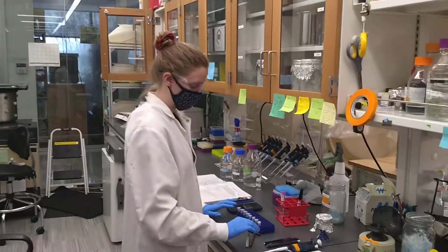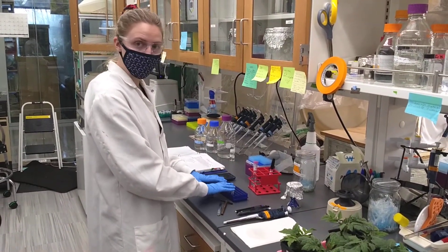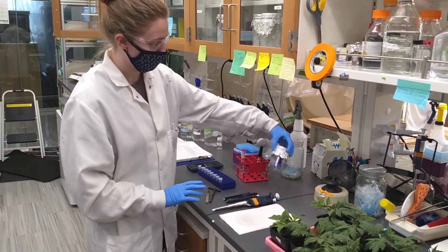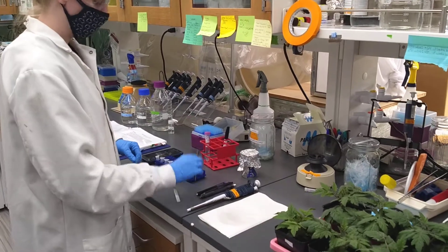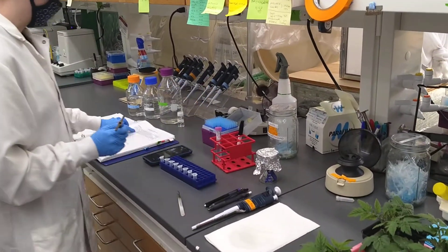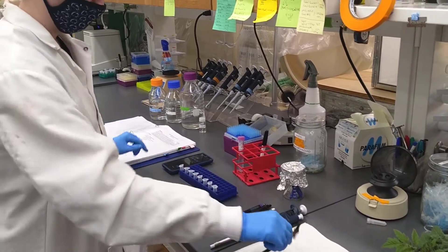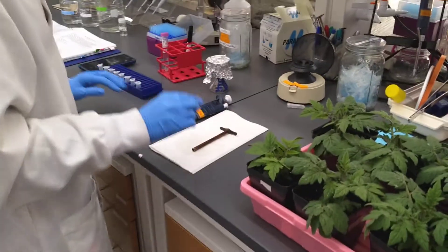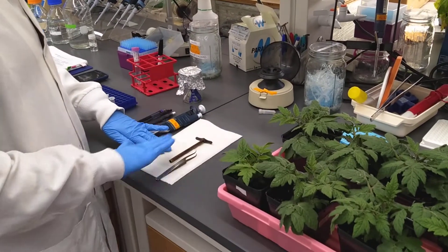The procedure is quite simple. We're going to use 1.5 ml microcentrifuge tubes and sterile micropestles. We're going to use a number 3 hole punch — the procedure specifies exactly the size hole punch that you need — and we're also going to use tweezers. We'll be sterilizing these in between samples so that we don't get cross-contamination between plants.